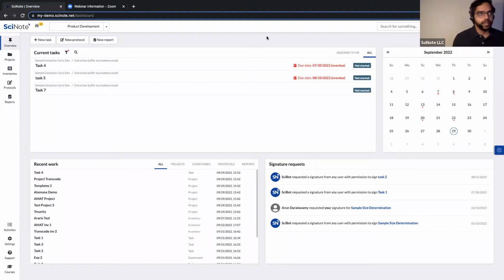So hopefully everyone can see my screen that I've shared. What I have here is our SciNote overview dashboard that's opened up. During this webinar, I will take you through the basic functions of SciNote, how to do various activities in SciNote. And of course, if you have any questions, like Kelly mentioned, drop them in the chat or Q&A section, and then we'll save some time at the end to go over your questions.